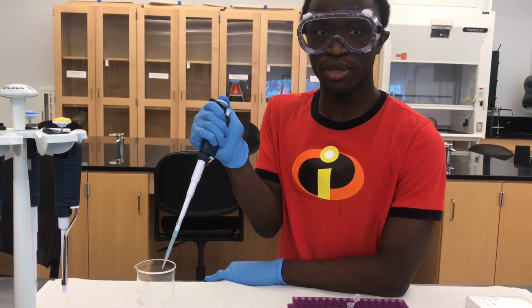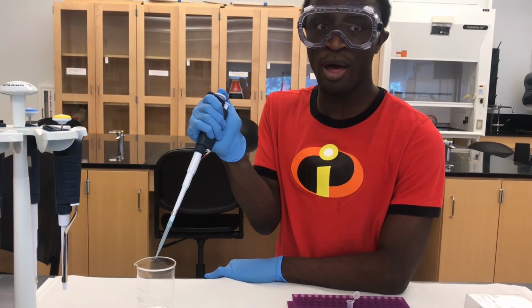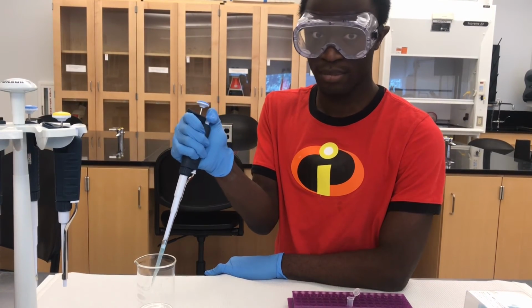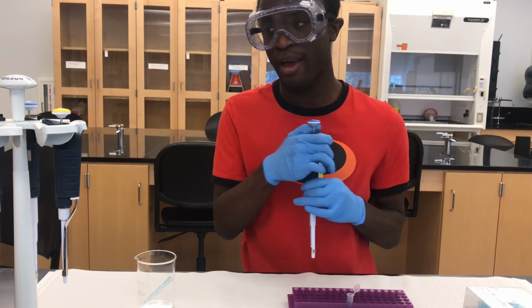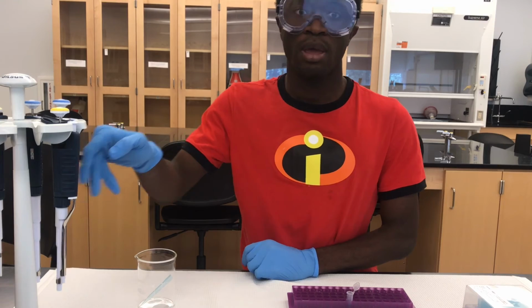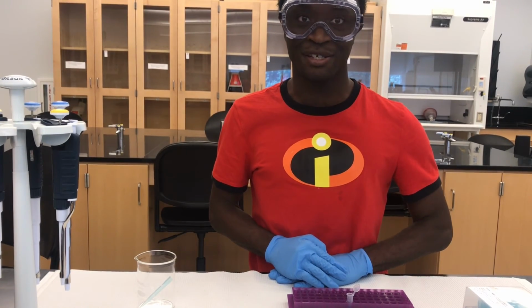Now you may release the plunger and eject the tip into the appropriate container by pressing the small white button at the top of the pipette. When finished using a pipette, carefully place the pipette back in the appropriate rack. A new pipette tip should be used when pipetting a new liquid or if a tip touches any surface.